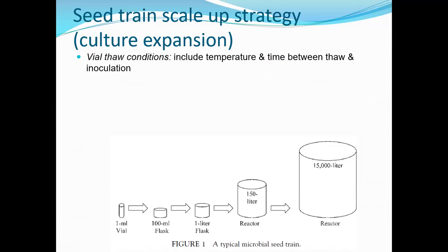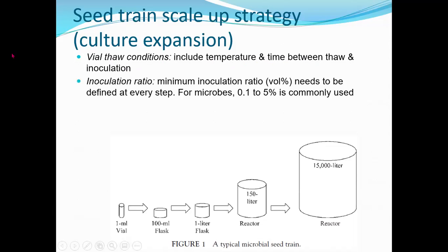How much is the inoculum? Then the inoculation ratio. So how much inoculum needs to be added with respect to the amount of total culture.